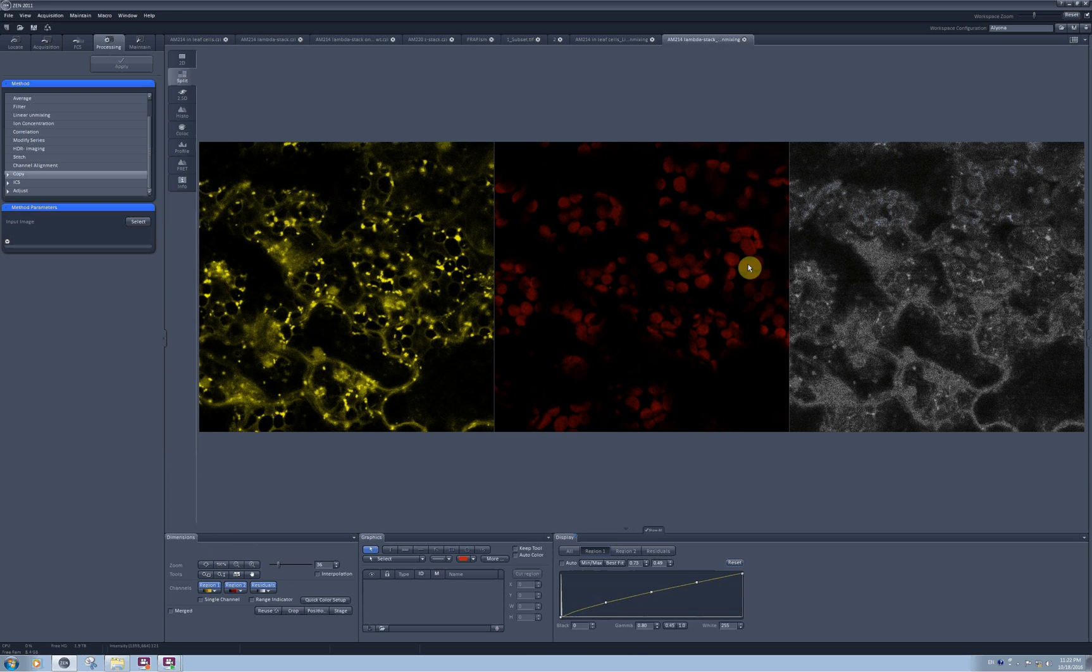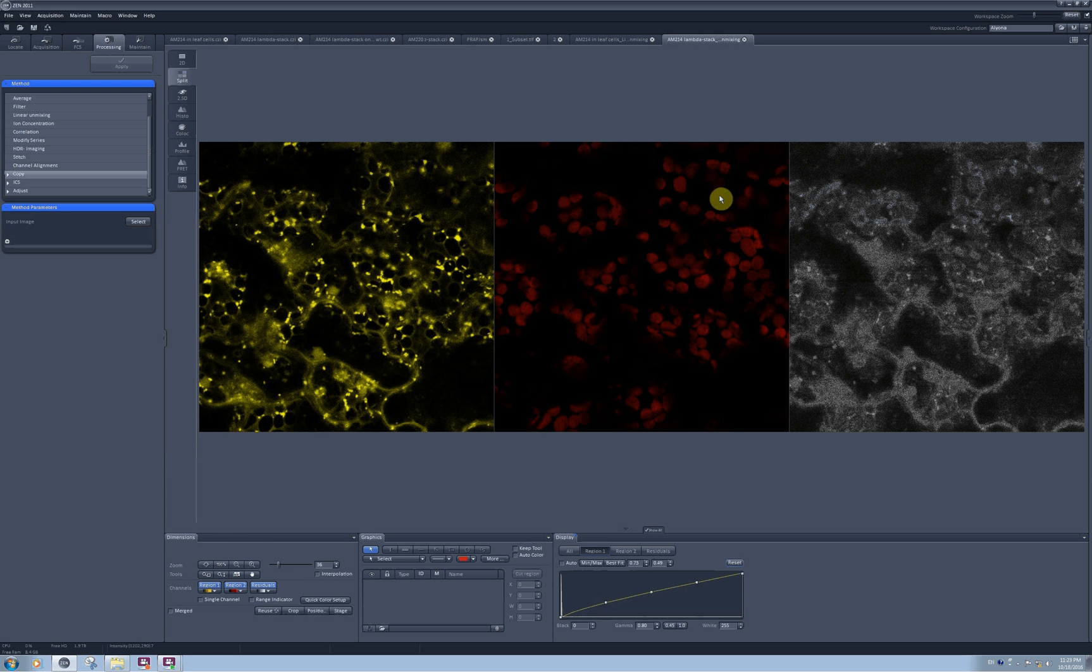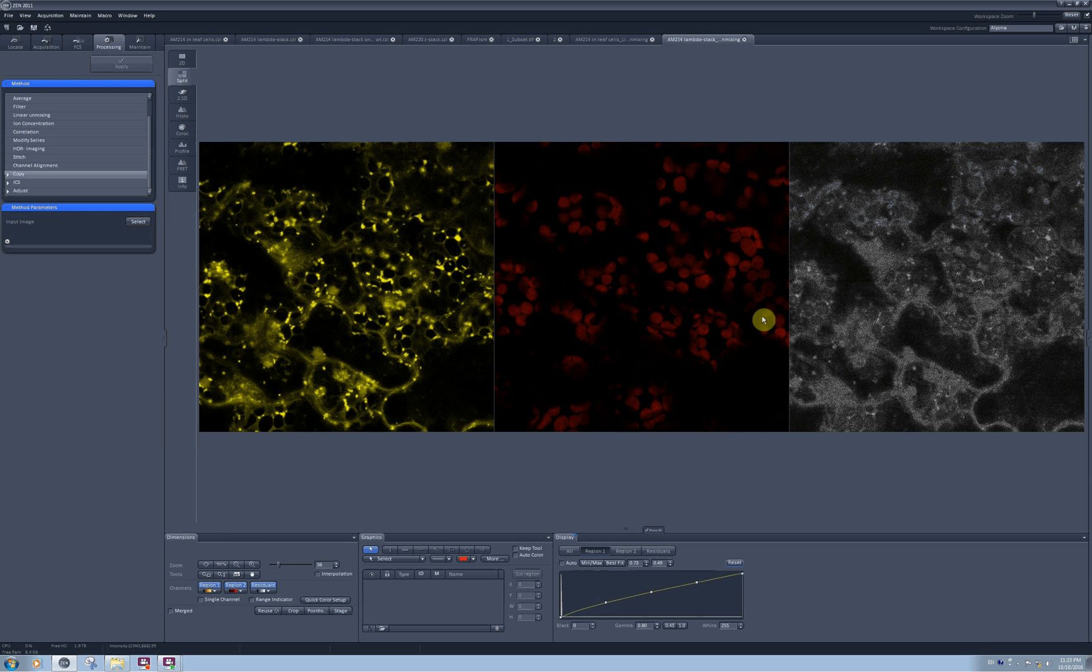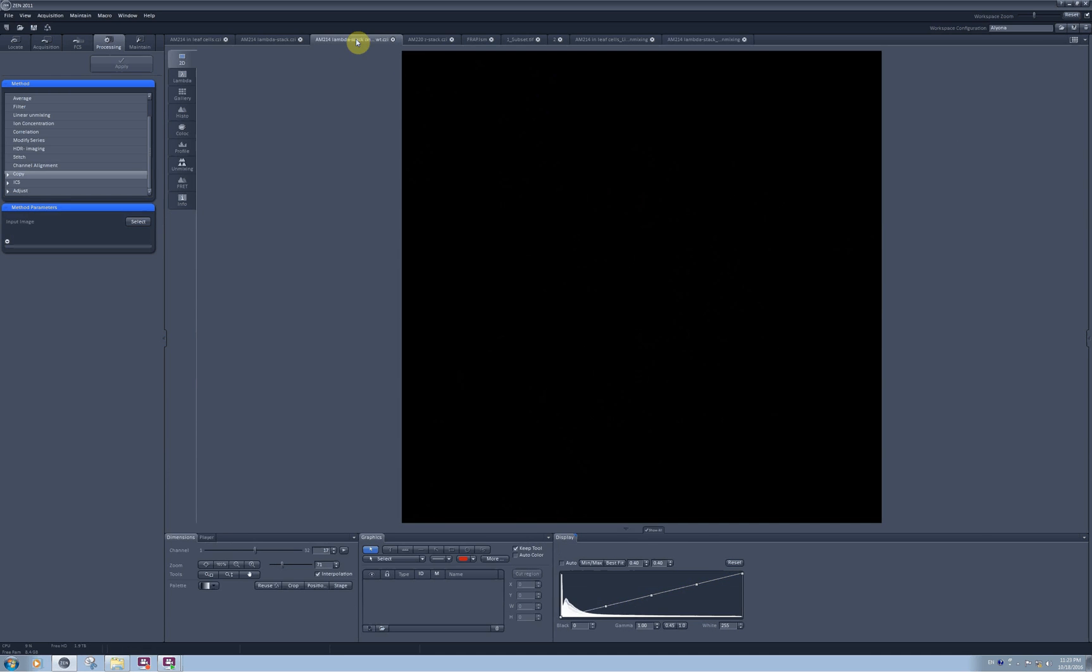You can create spectra for the fluorophores in your sample and save it to the database and then apply it later to your images. For example, I scanned with exactly the same settings a wild type plant to detect what is the autofluorescence of the chlorophyll, and I have this lambda stack here.